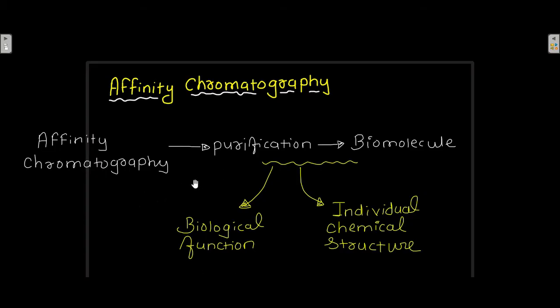In this video, we are going to discuss affinity chromatography. Affinity chromatography is the purification of a biomolecule, and this purification will depend upon the biological function of the biomolecule or the individual chemical structure of the biomolecule. The separation is done on the basis of these properties, either its biological function or individual chemical structure.